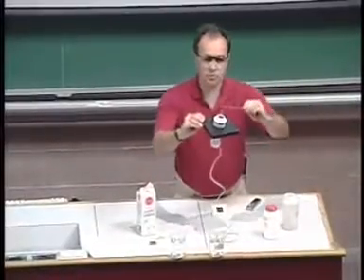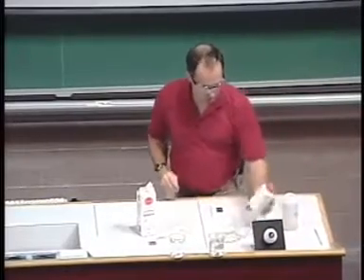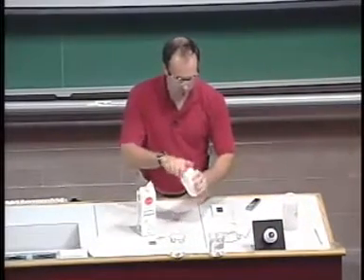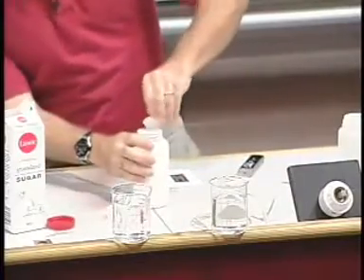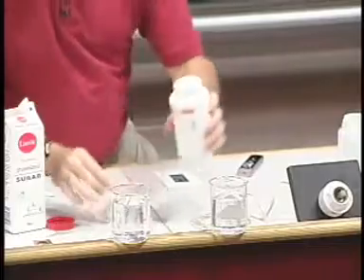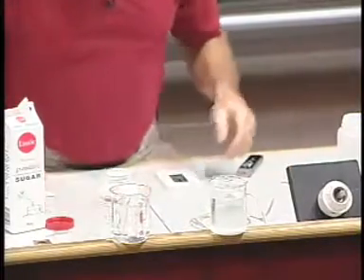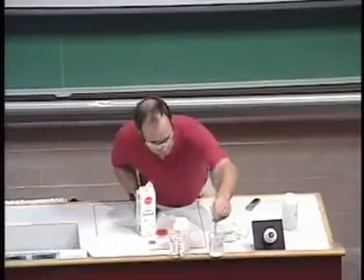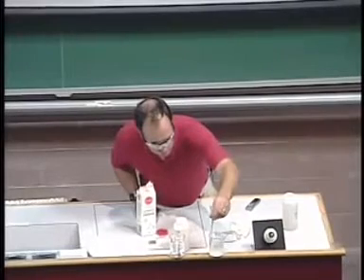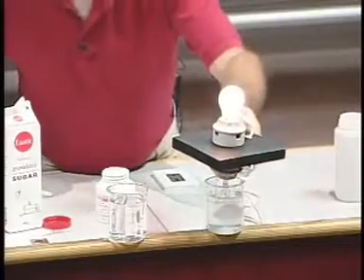Now, what is it that carries charge? In the case of this thing, it's electrons being transferred through the spatula, and the electrons are mobile in the metal, so they are what carry charge. But what if we have something in solution, like some sodium chloride, common table salt, safety seal. So let's put some salt in here. Stir it up a little bit. Now, this is dissolving, and my claim is that this is turning into ions, but the only way we could know that there are ions in there would be to show that the solution has some electrical conductivity, and you can see that, of course, it does.